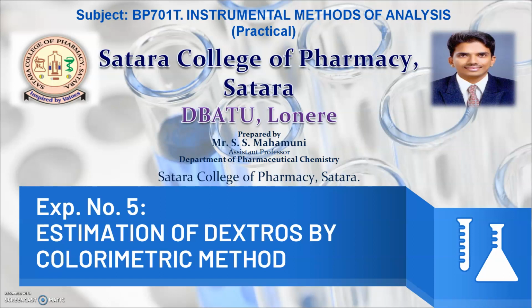Today we are going to see the practical of the subject Instrumental Methods of Analysis from the final year B Pharm. The experiment number is 5, that is the estimation of dextrose by colorimetric method. So we'll start with the experiment.